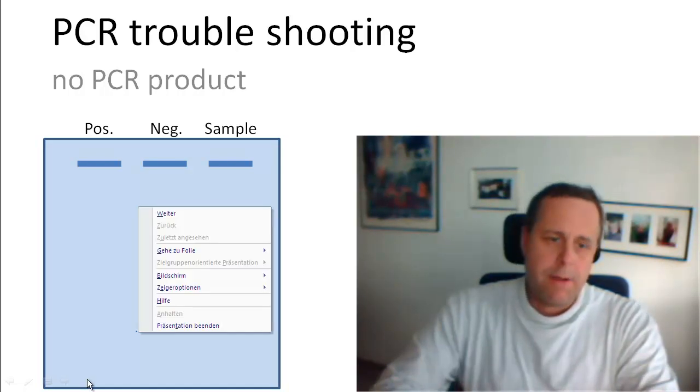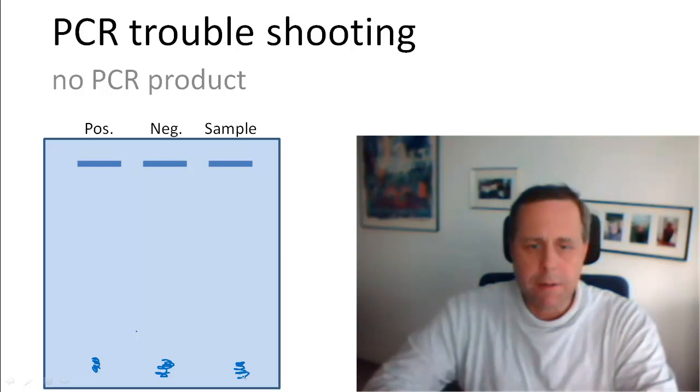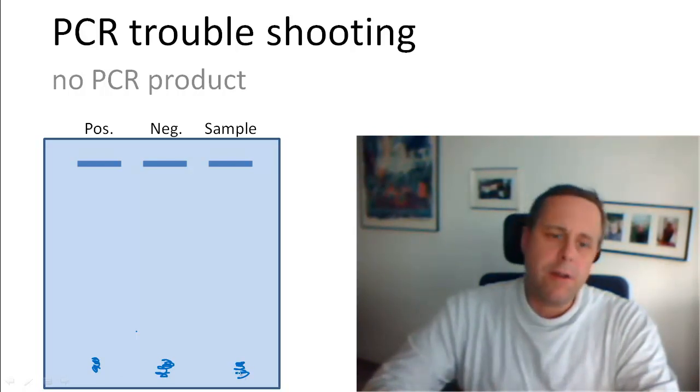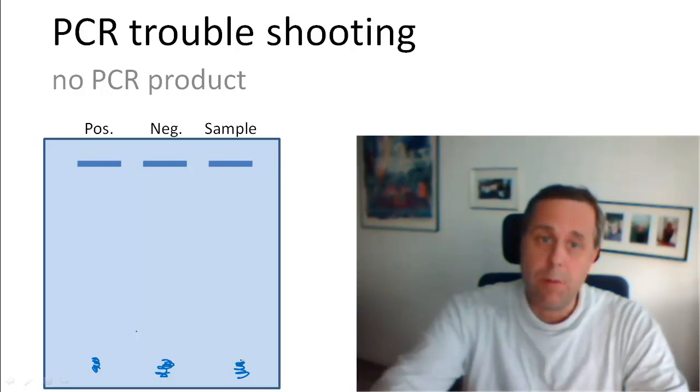What you get in this case is just a little bit of a smear like here and here if you run your PCR products on an agarose gel. That's representing your primers that have not been used for amplification, and otherwise you see no product at all. So what could have happened? Why could it not have worked?